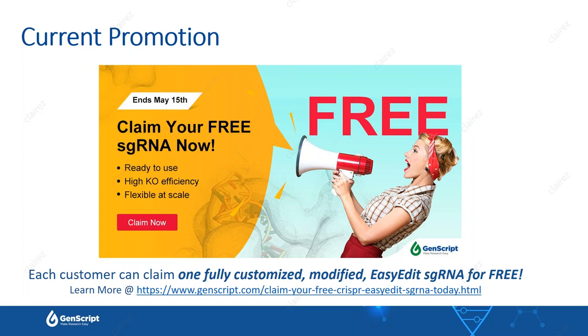Some repetitive questions about delivery methods. Another question, why don't you use plasmid? Right, so the plasmid system, like I discussed, has advantages, of course, namely cost. But in terms of editing efficiency, it's not that high. And often people find they need to do some sort of selection, whether it be GFP or antibiotic selection, in order to enrich. Whereas with the RNP system, you do not need to do that. I showed some of the data in the paper, the expression of the Cas9 and the editing are not exactly ideal. And you get this sort of lingering Cas9 protein, which can result in increased off-target effects.